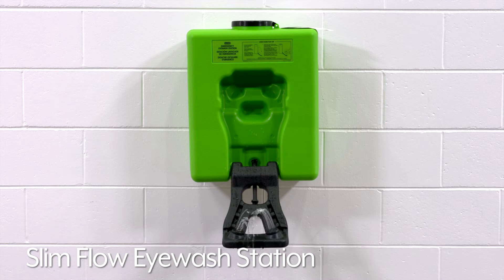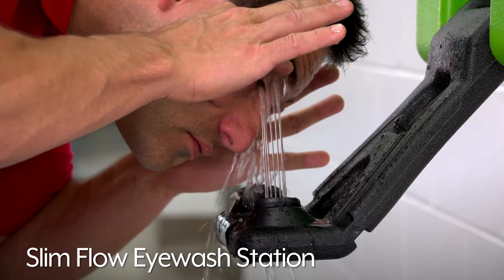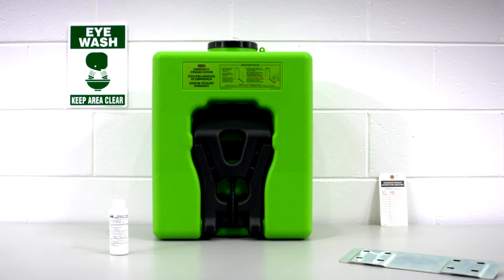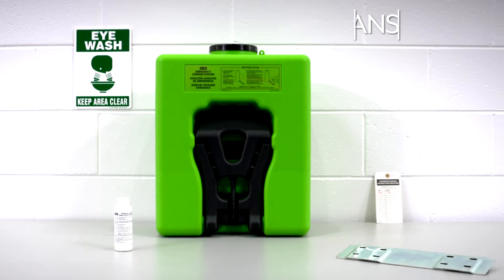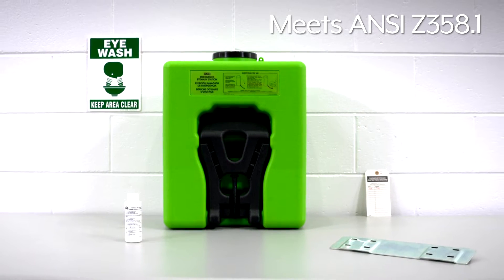Uline Slim Flow Eyewash Station's low-profile design saves space and provides 15 minutes of uninterrupted flushing without costly plumbing. It includes everything needed to meet ANSI's standard Z358.1 for treatment of accidents involving eye contamination.